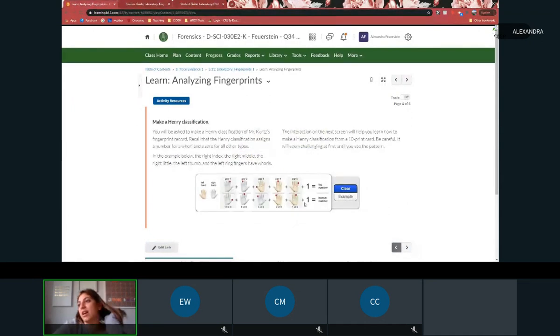2, 1. So just knowing that it goes by a half down the line, I think it's going to be difficult to know, okay, this is a 16 or a 0. This one is an 8 or a 0. This one is a 4 or a 0, right? So keep that in mind when you're going through this lab, to remember the numerical value that you're going to give it. And it really only gives it a value if it's a whirl. Okay, and then you can use this number to compare to the others.